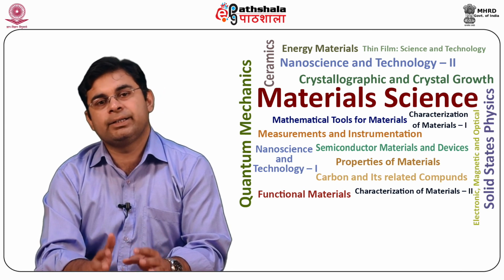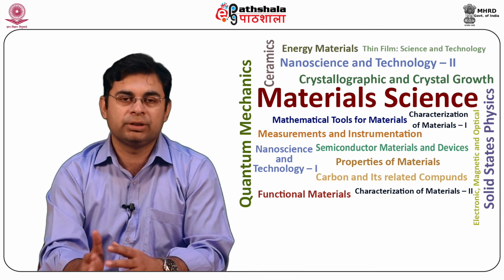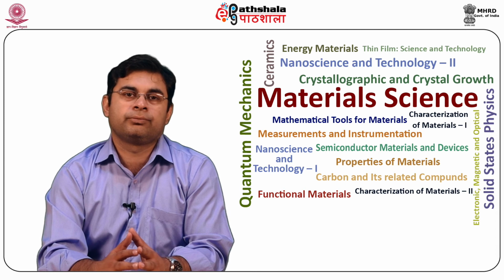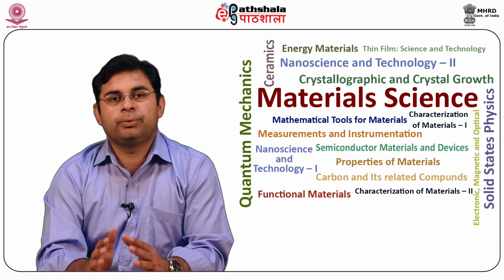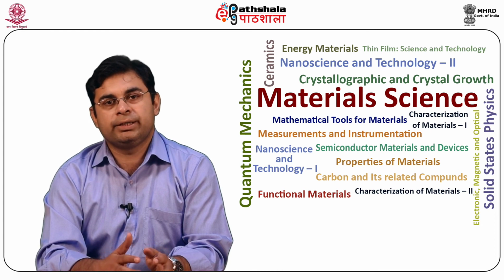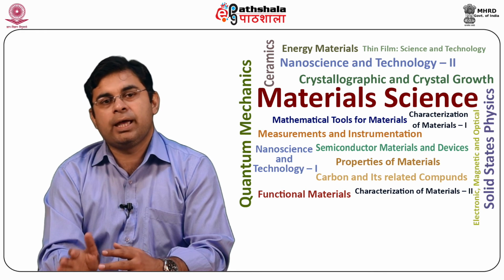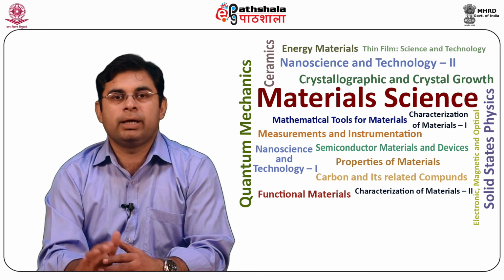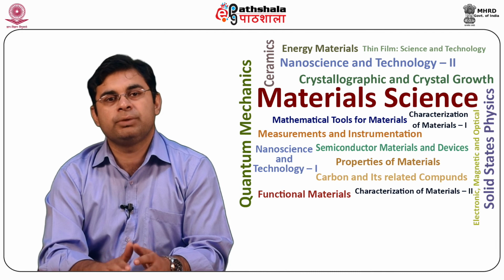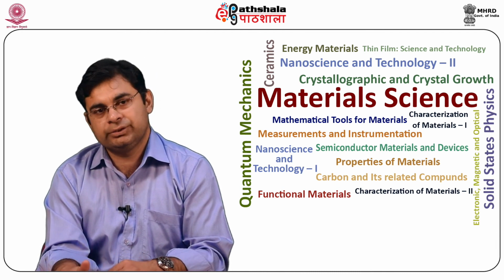They are characterized by their force constant and resonant frequency. The probe of the appropriate specification should be selected while studying the sample. Additionally, an optical detection system and electronics for the management of the scanning procedures and data acquisition are necessary.